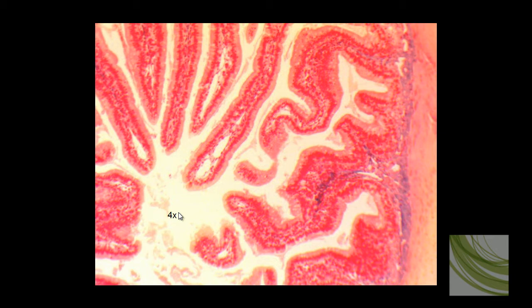This is a really good slide for looking at a characteristic of simple columnar that should help you identify it on a test. When you're looking at the nuclei, they form a pretty distinct band. They're all at about the same level within the cell. You can almost see this dark red line at 4X of nuclei.